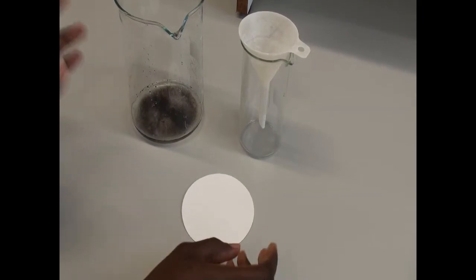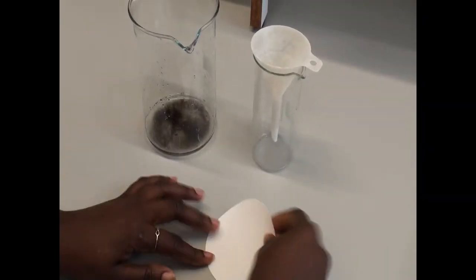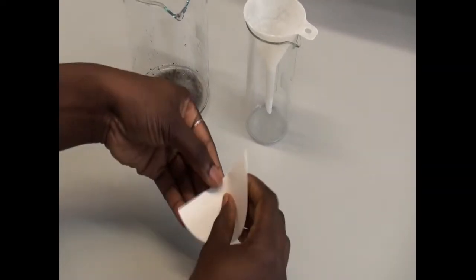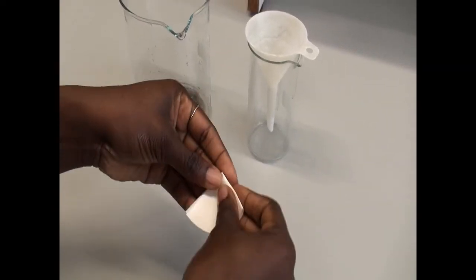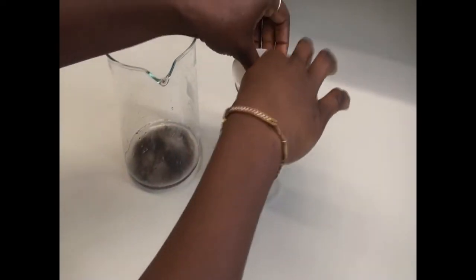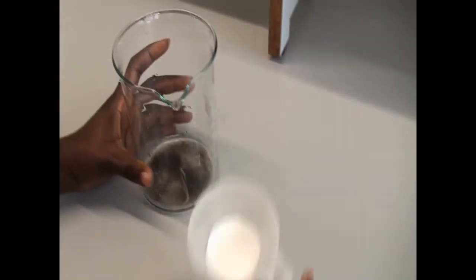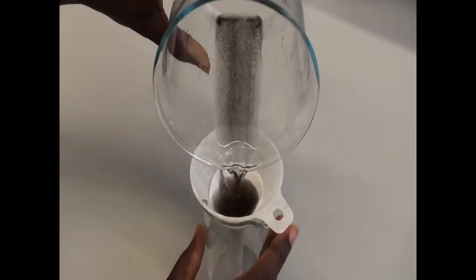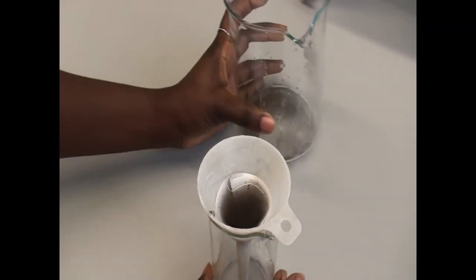To concentrate the cysts, we are going to need a filter paper, which we will fold as illustrated. Then we pour the suspension into the filter paper and allow the water to drain.